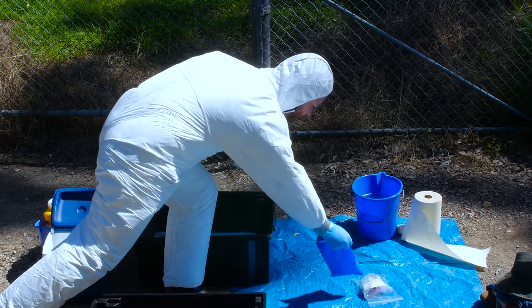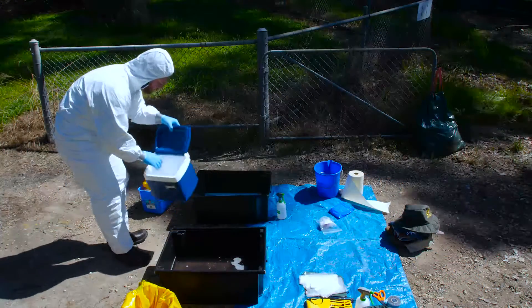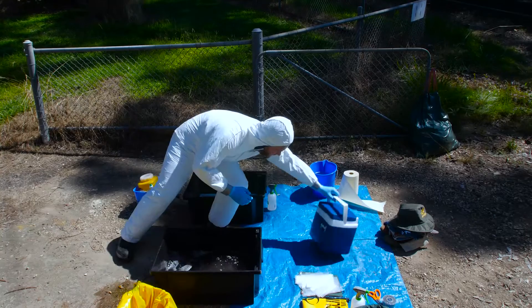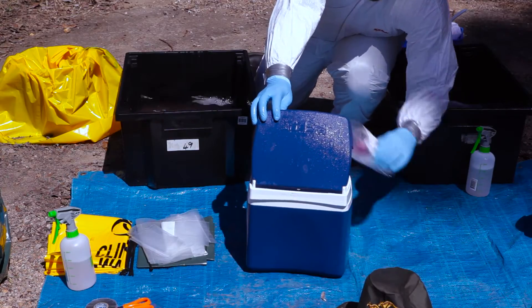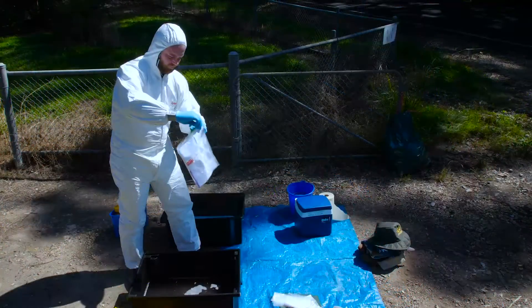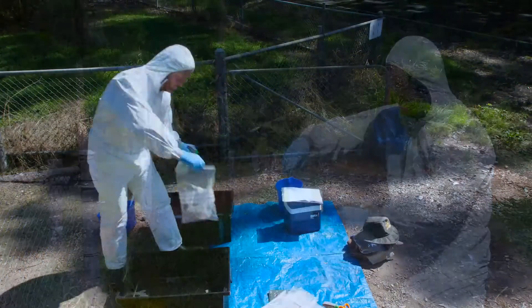If using only one sample esky, disinfect ice bricks and place across to the clean side, then empty the esky of any liquids. Disinfect the esky and place it across to the clean side before placing disinfected ice bricks and samples back inside. Follow the same disinfection and double bagging procedure for paperwork and personal items such as your mobile phone and car keys.